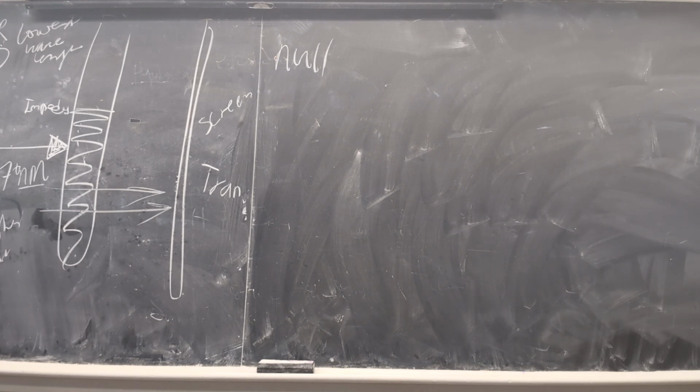The enzyme. So if I add the enzyme, did you guys add the enzyme? If you add the enzyme, you have first and last step. So you need the substrate. You know that? So add the substrate. Add 3 drops of hydrogen peroxide. Now you guys have everything.